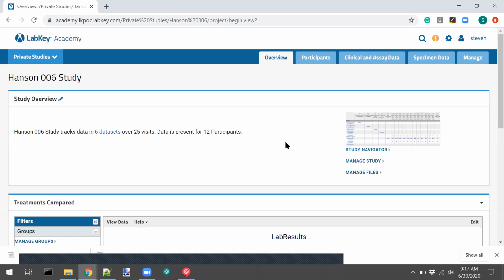Any good questions, Jason? Yeah, there is one. You just published 2 studies, 6 and 7. If you were to do what you just did twice, would the randomized participant ID be the same in both cases, or is it random in both cases? I think it would re-randomize them. I'm not totally positive. I think I'd probably have to go through it again. I think it would just re-randomize them, but I'm not 100% confident about that. Anything else? No, that's good for now, Steve.